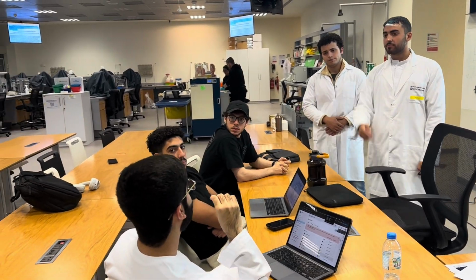Actually, I have a question. How are these nanopores fabricated and inserted into the flow cells? That's an excellent question. Let's dive deep into how these nanopores are actually made and used in these sequencing devices.